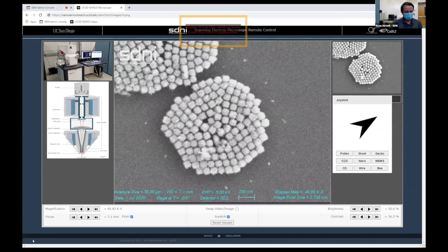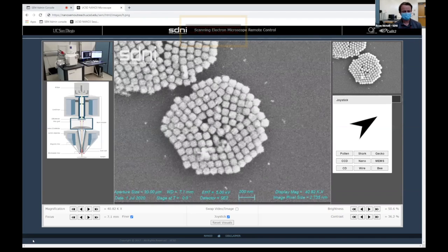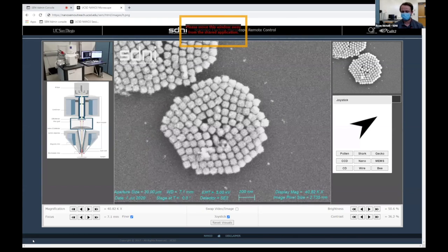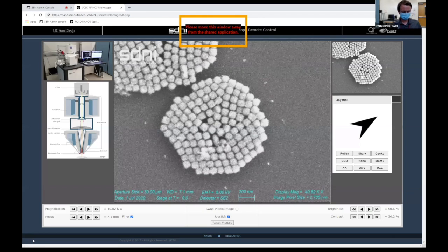Okay, so in an optical microscope, you're looking typically at reflection, and different materials reflect different wavelengths of light, and you have a color sensor that allows you to decipher and make color images. That's sort of how our eye works as well. We've got different cone cells and so on, rod and cone cells deciphering intensity and colors and so forth.